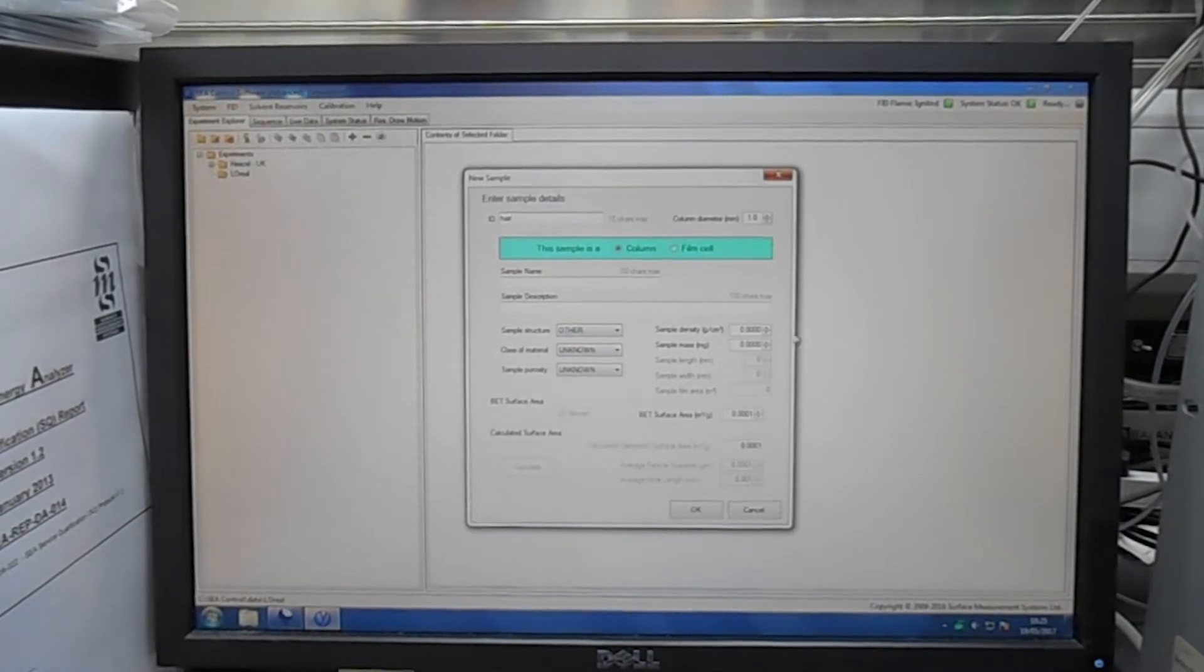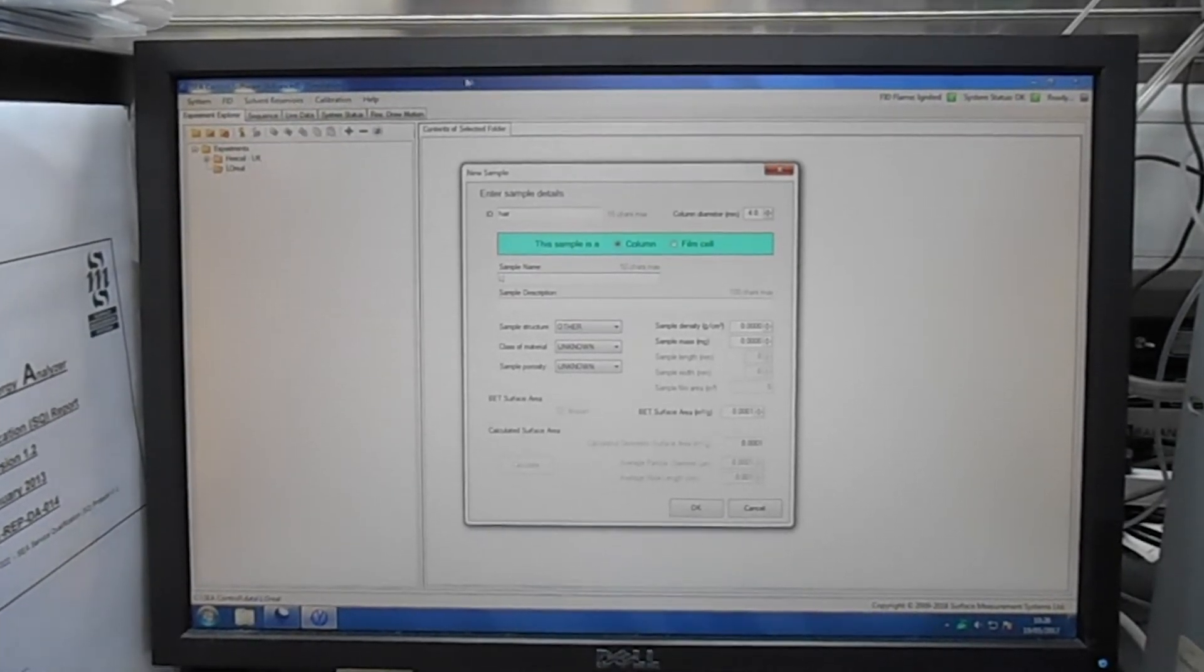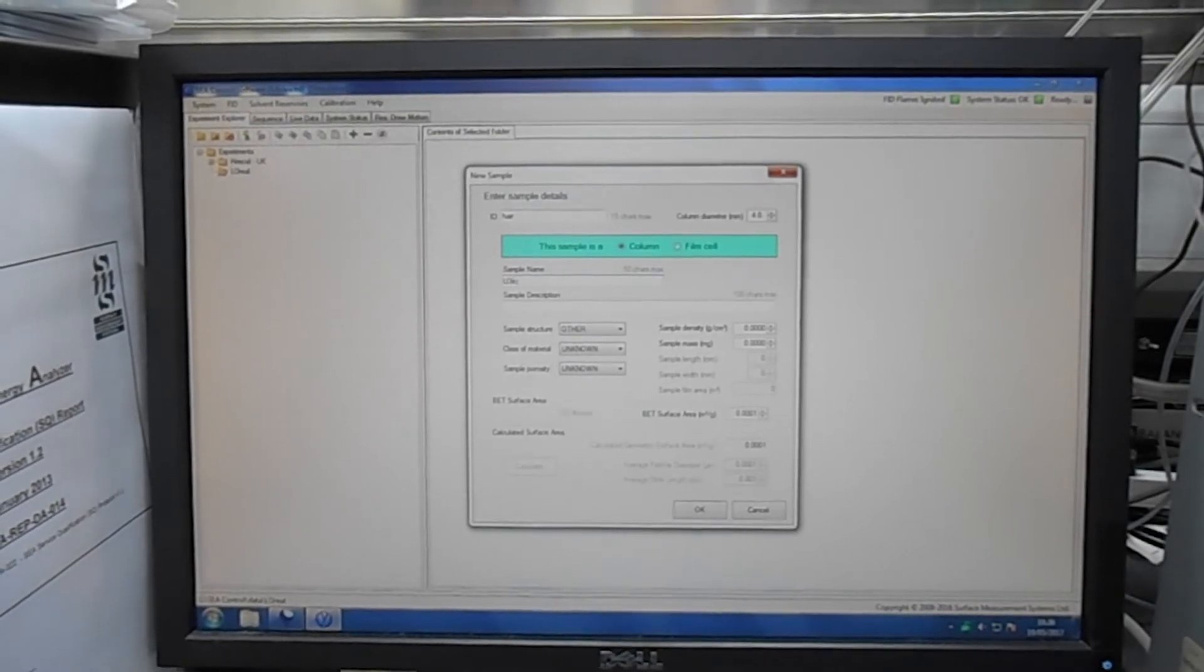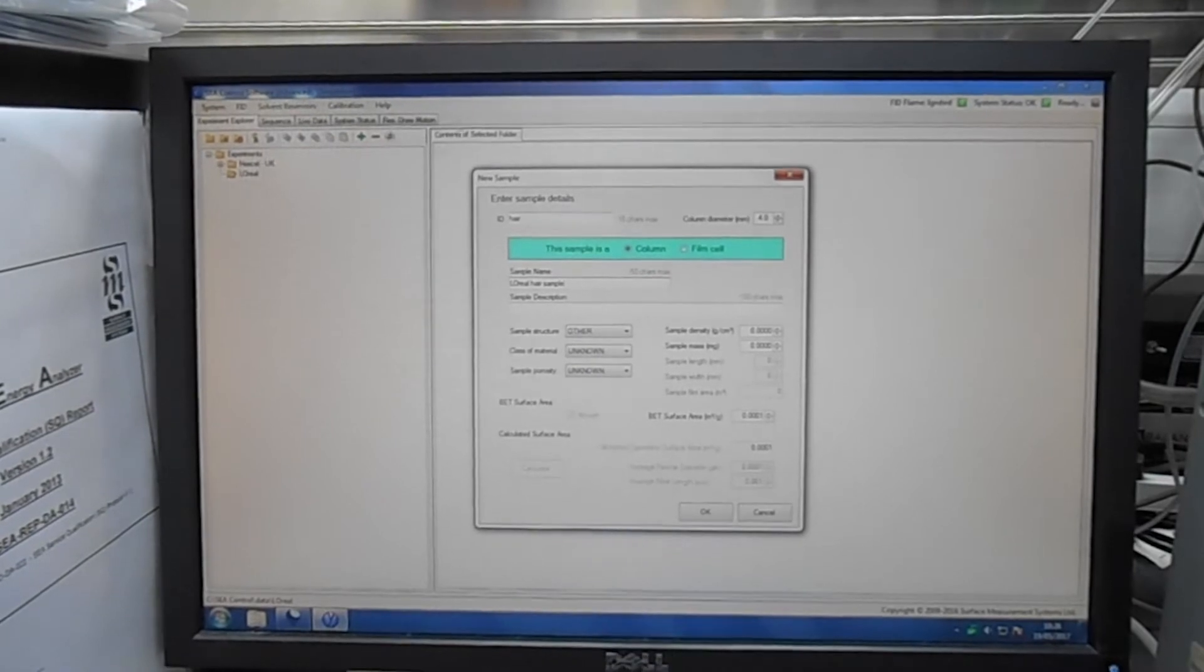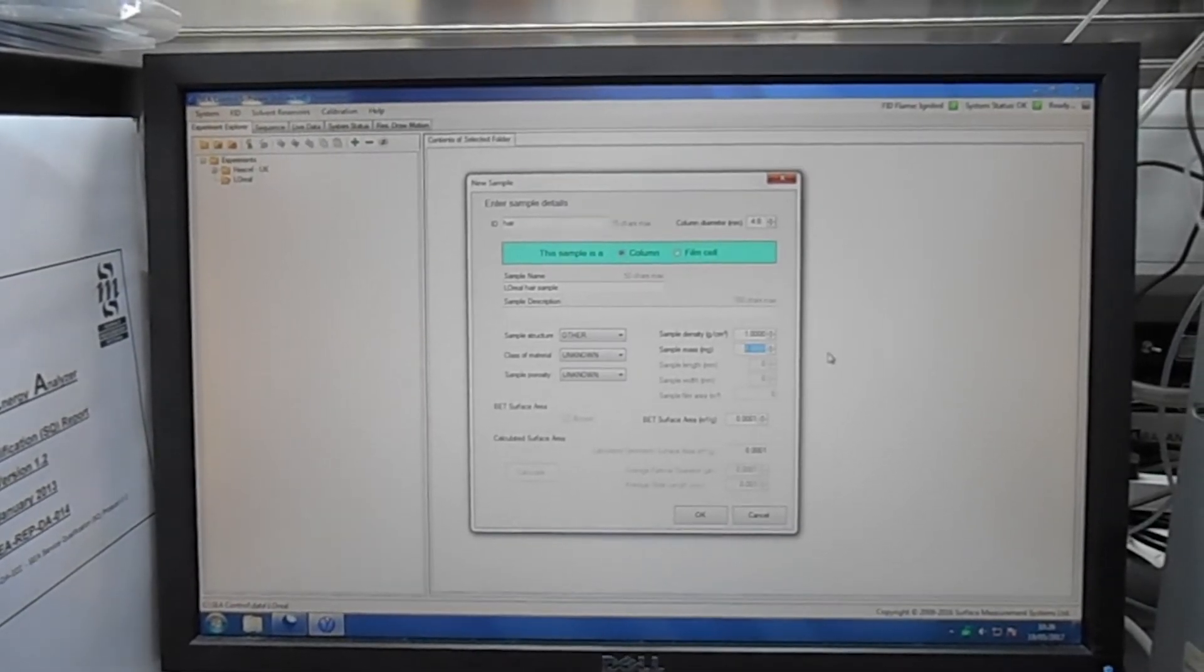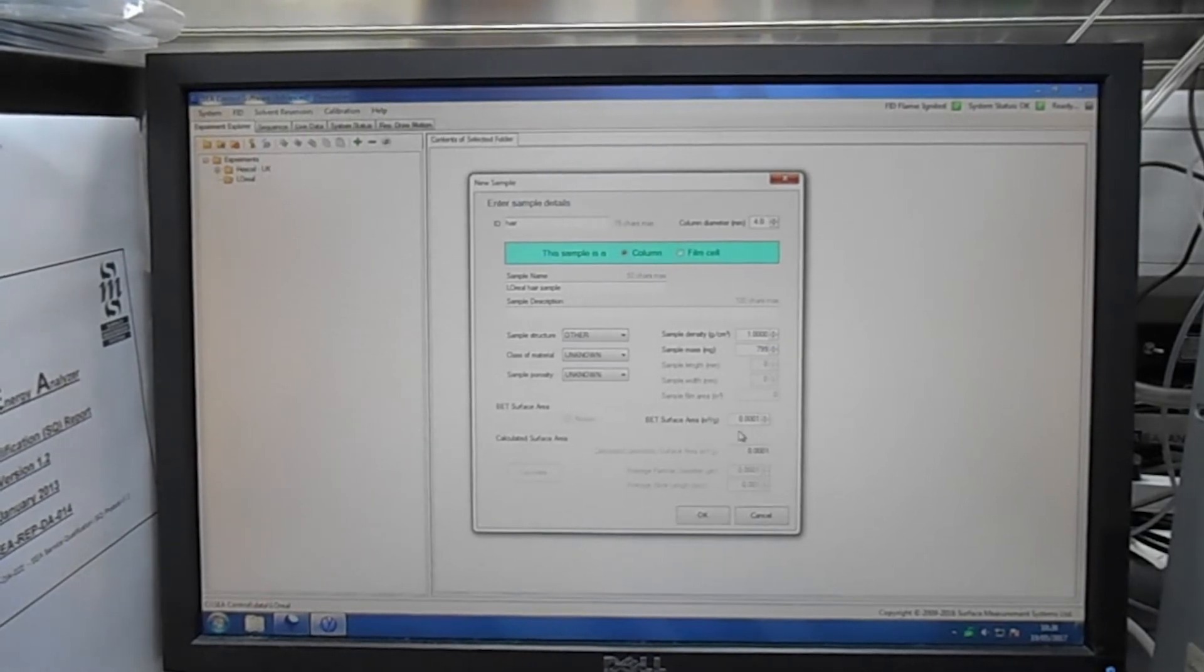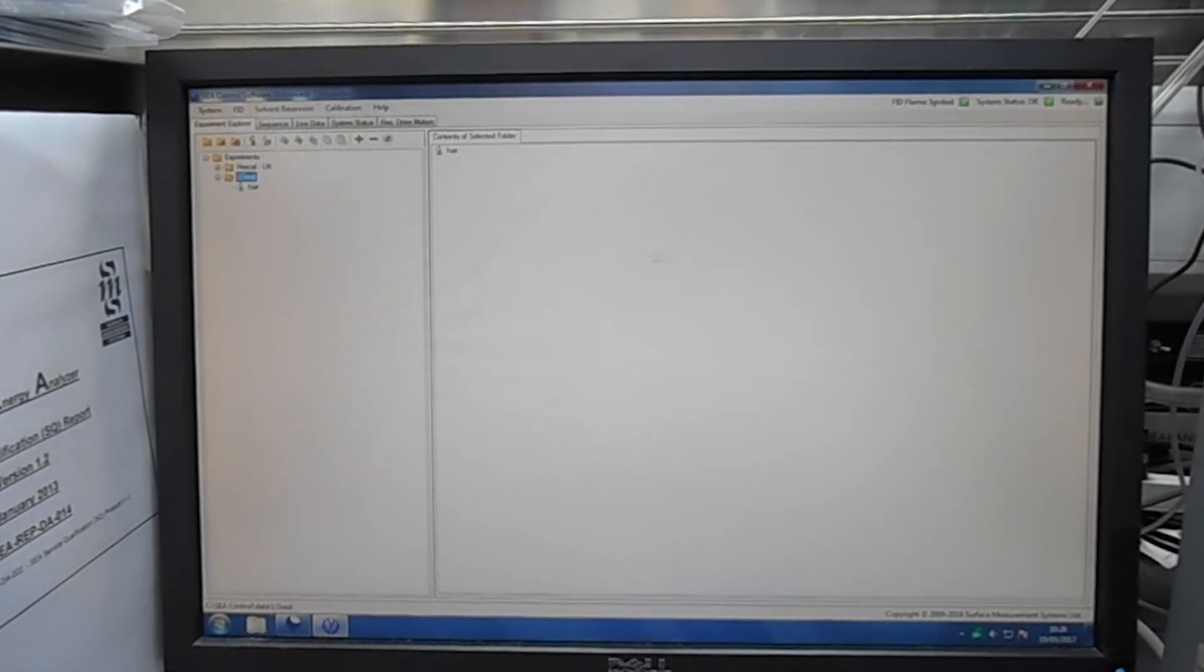Some of the information are required only for specific types of analysis. For example, sample density is only required for solubility parameter, while BET surface area is always required even as an estimate for any type of measurement. The estimated surface area for hair sample is usually around one square meter per gram.